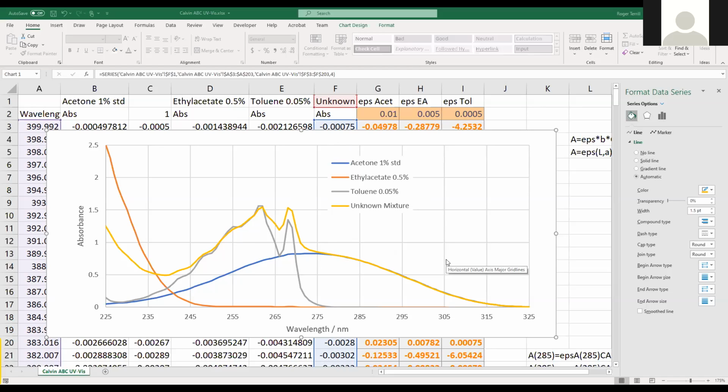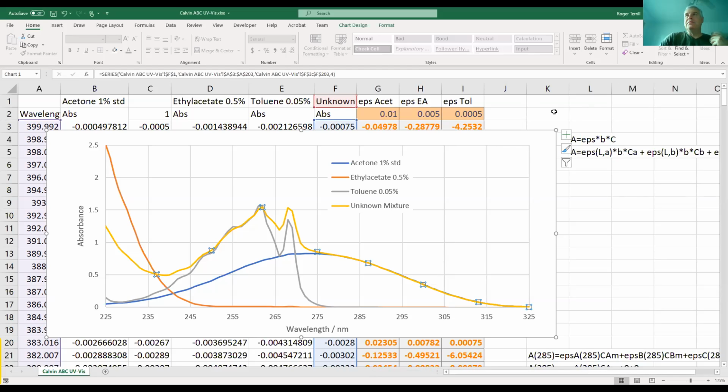Wouldn't there be 0 ethyl acetate, like once it hits a little after 245 nanometers? Ah, okay. Excellent comment. May I pick on you a little bit, Abby? That's fine. Okay. Everybody, enjoy, because I'm going to pick on Abby a little bit.